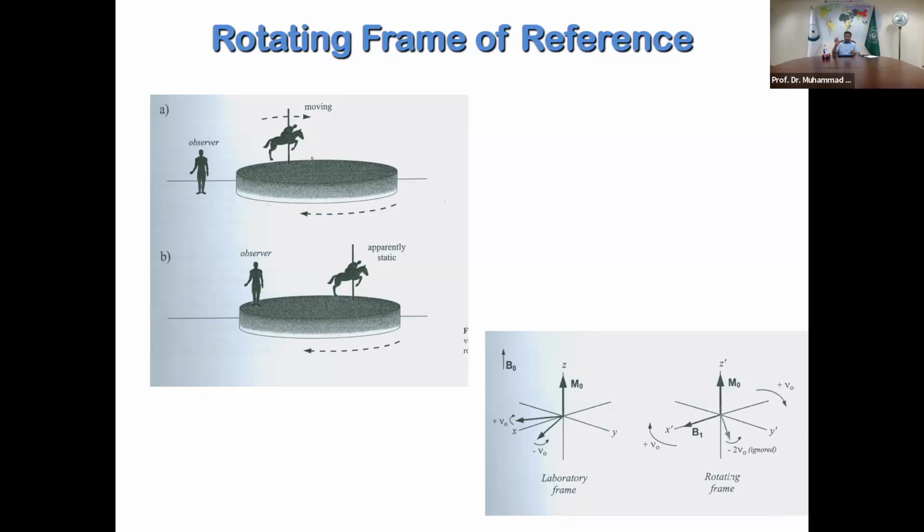Then you give a second pulse, and so many experiments, thousands of NMR experiments, have a second pulse, third pulse, fourth pulse, fifth pulse, and literally hundreds of pulses. The one single pulse, which you have seen in a simple proton NMR or simple coupled C13 NMR experiment, is the easiest thing, and happens every day, but the majority of NMR experiments are not as simple.